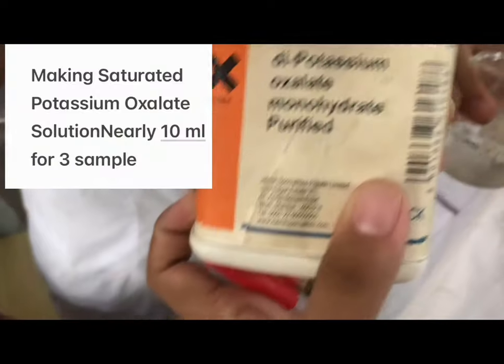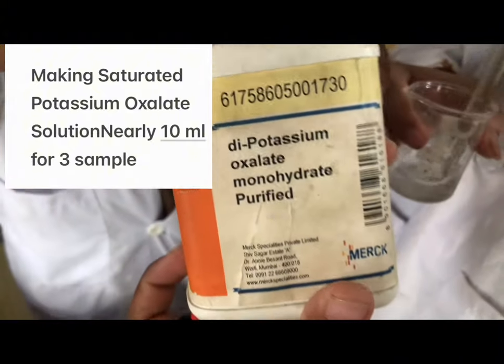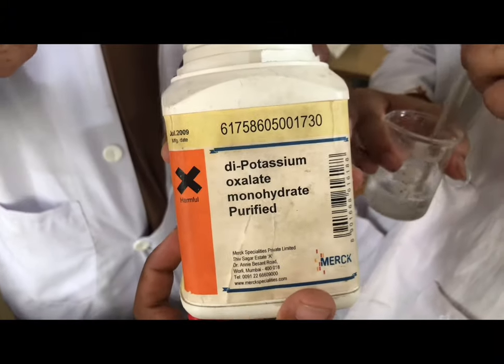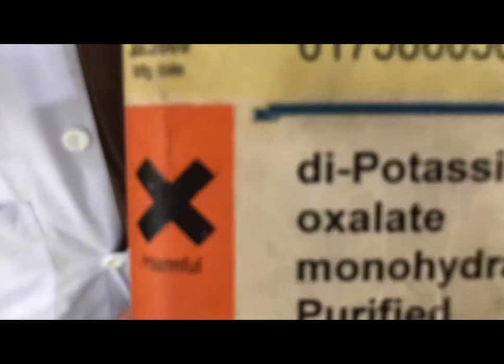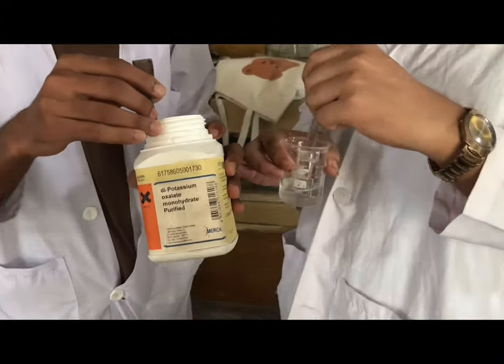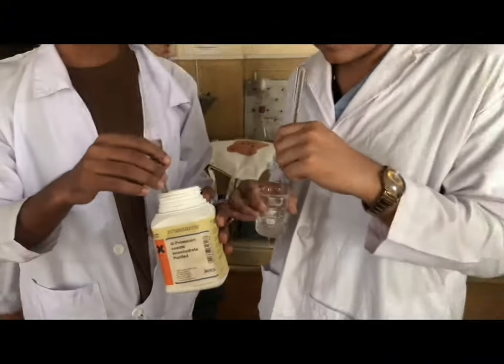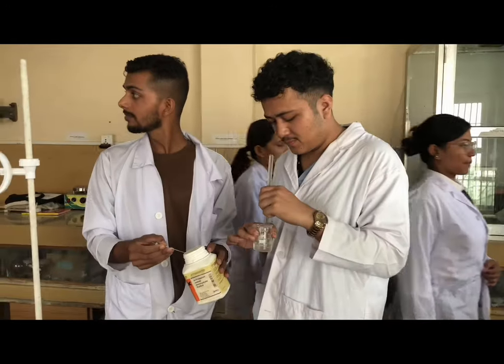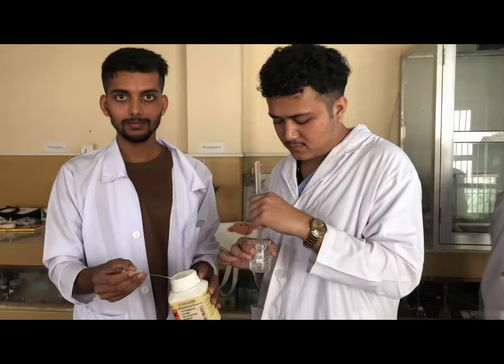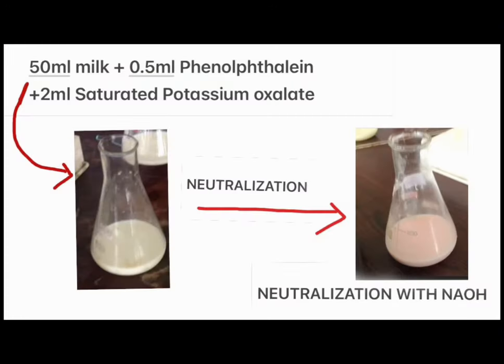This is a saturated potassium oxalate solution. This is a 50 ml milk sample: 0.5 ml phenolphthalein plus 2 ml saturated potassium oxalate.